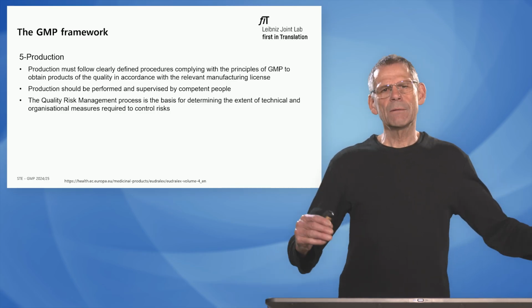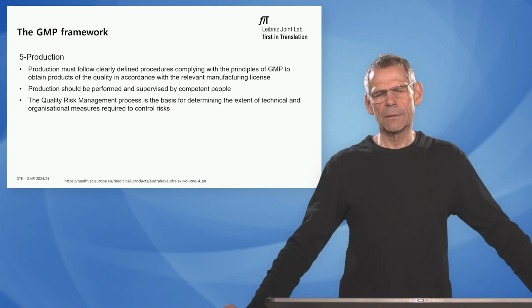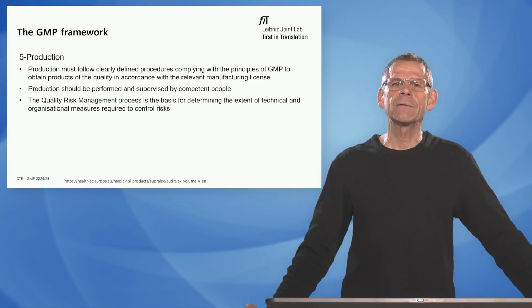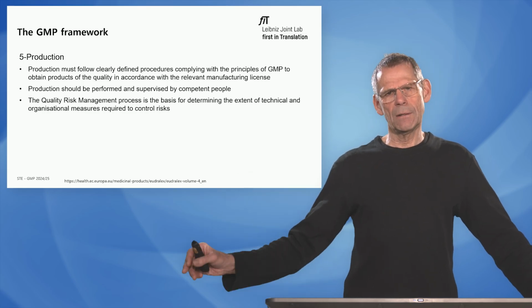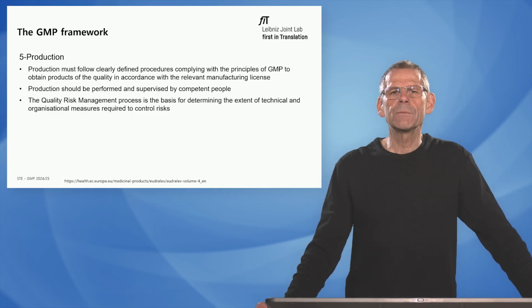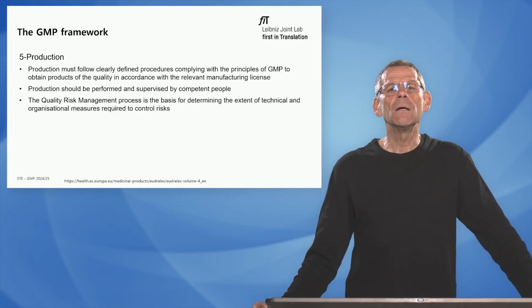This goes back to the fact that in a manufacturing, we identify early on in our development that there are certain aspects, either material specification or process parameters, which bear a risk of failure in the final quality, which means that we need to have a clear risk management system, how we would deal with certain risks and how we avoid that these risks get through.